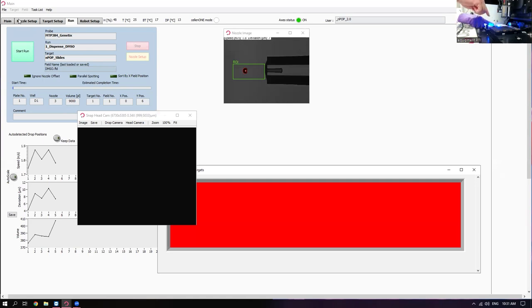Yep. From this tube here. Yep, that's where we got the DMSO. That's for cleaning reagents, and then also for the acetonitrile-water mix for cooling, for essentially collecting all of the digested peptides that have been labeled into a single volume and putting them into a 384 plate.